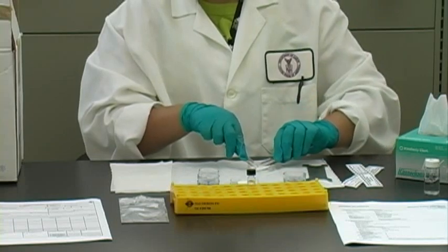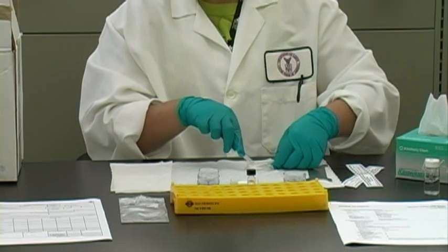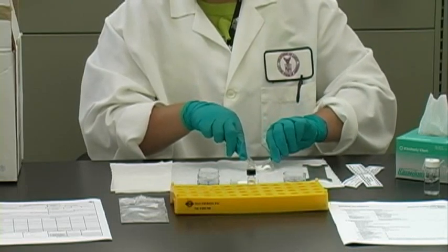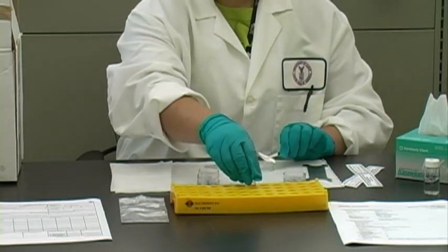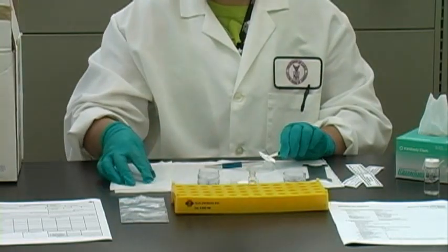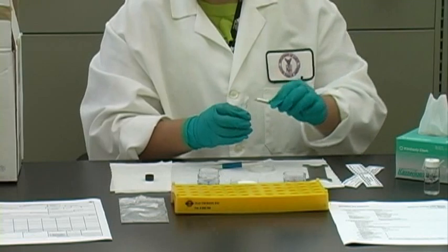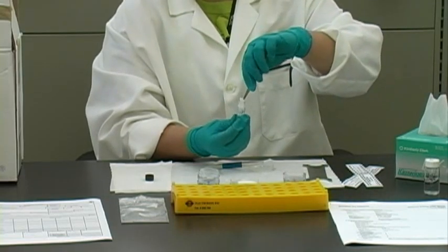Gently roll the coated filter to form a cylinder that will fit into the vial. Remove the cap from the vial containing the extraction solvent. Be careful not to spill any solvent. Place the filter into the vial with the solvent so that it is flat against the inside surface of the vial. Avoid folding or crumpling the filter.